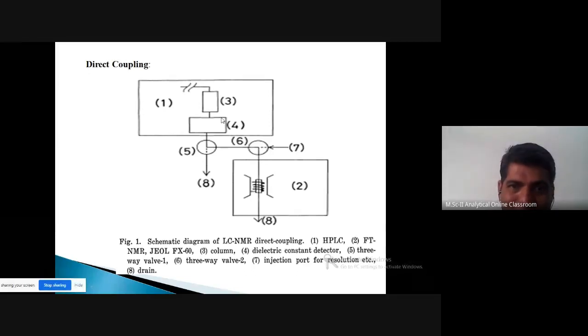देन सेकंड सॅम्पल जो त्याच्या मागच लगेच येतोय. कॉम्पोनंट एका मिक्सरमध्ये तीन कॉम्पोनंट आहे, पहिला झाला की दुसरा. ओके, सो सेकंड लगेच येईल, लगेच ह्याला आपल्याला पास करावं लागेल आणि लगेच त्याचं अनालिसिस करावं लागेल. सेकंड झाल्यानंतर तिसरा येईल, तिसरा लगेच ह्या दिशेने आपल्याला त्याचं वर्किंग घ्यावं लागेल.